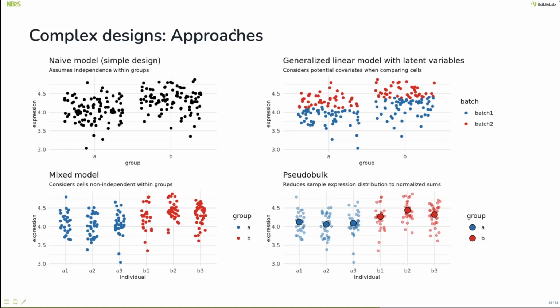Yeah, so it's essentially that instead of sorting beforehand and running bulk RNA-seq on all of the samples, you can start from the cells and then group them as if you were sorting them. It will be more artificial because you've grouped them according to the RNA, which is a little less reliable than FACS markers and things like that. But you can definitely do it on individual clusters.